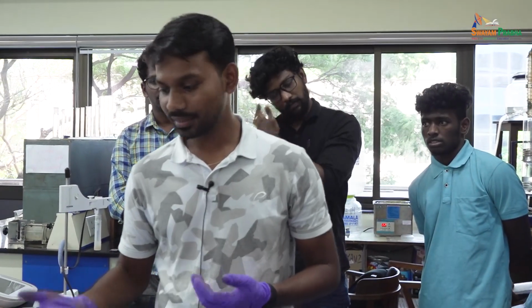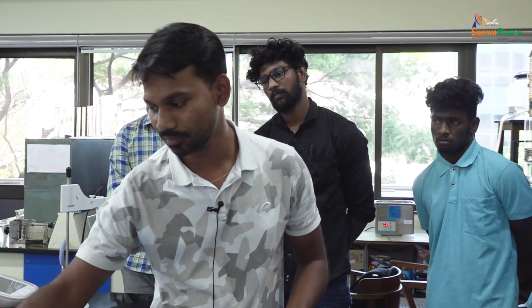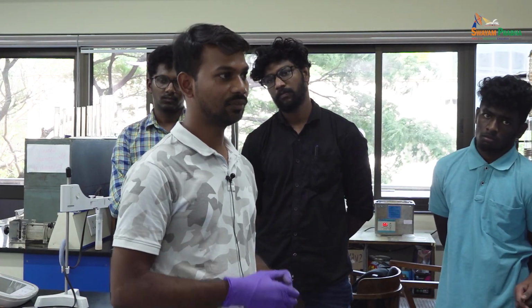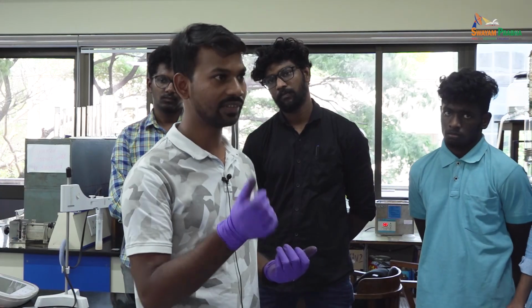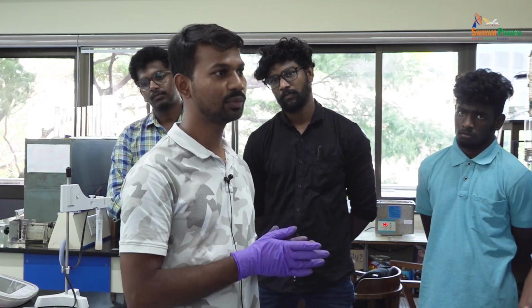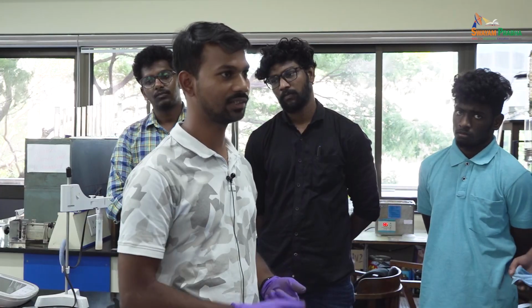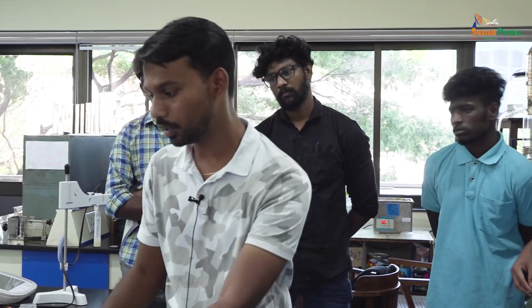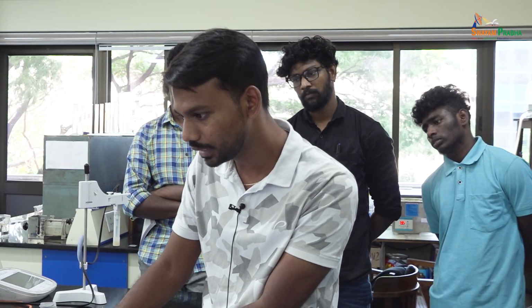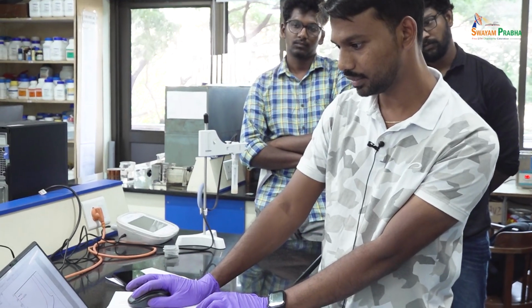So why are we plotting log? We can find ECOR very easily where the intersection point is, but we can't find the ICOR directly. Why is it? Because at the ECOR value the difference will be 0. At 0, if you apply a log value, it will give negative infinity, which our potentiostat can't measure. So we plot the linear regions and extrapolate them, so that at the intersection we will get the ICOR value. First we will determine it for the acid rain solution.